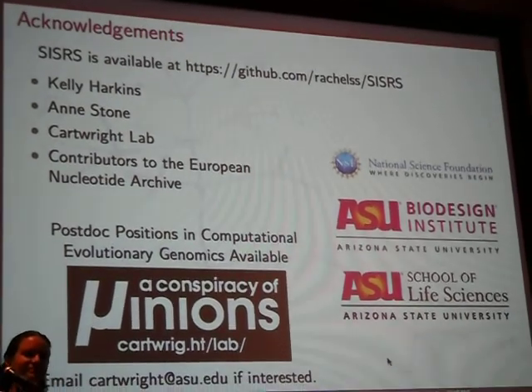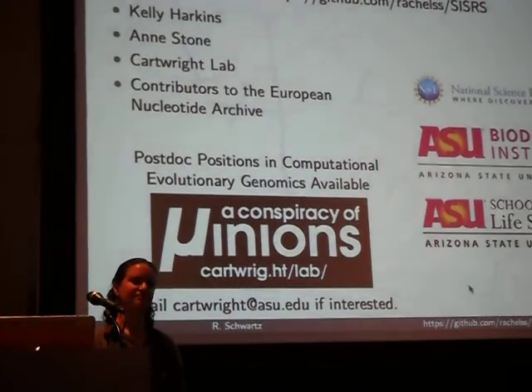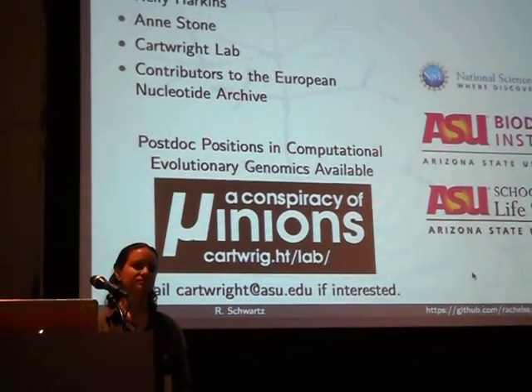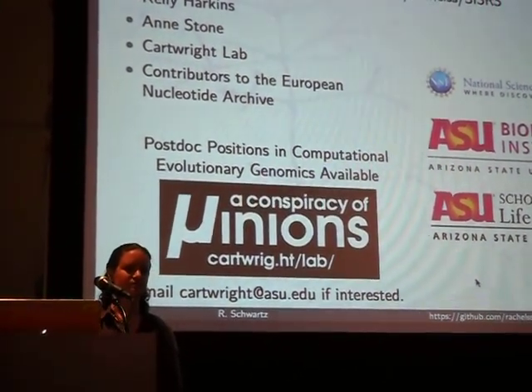Do you know how well your method would do with handling a genome that has a lot of, like when doing composite genomes, would you come into problems if there were like a whole genome duplication event happening somewhere in the history of those taxa? Like, will it collapse those?